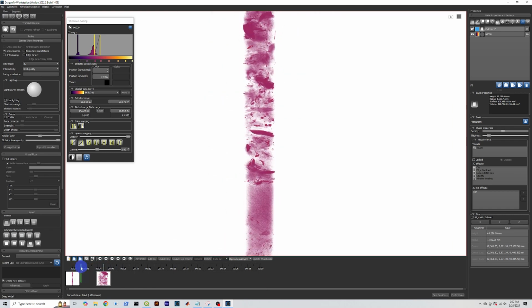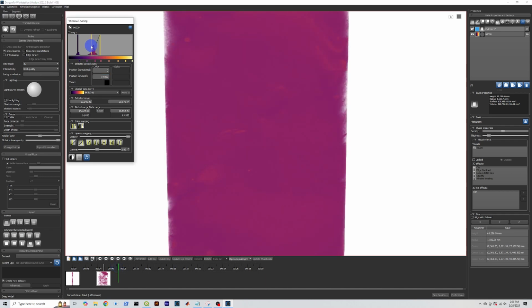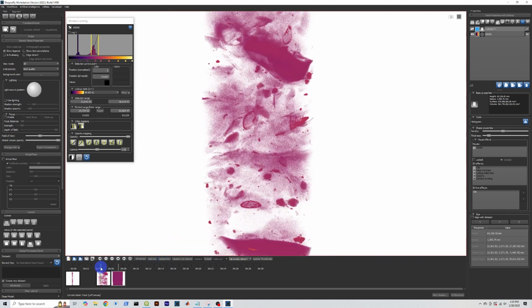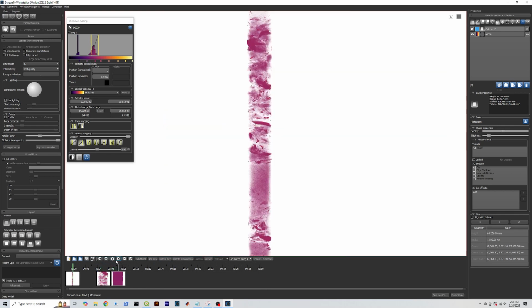Okay, cool. So we can do that, and for every keyframe, you can change whatever you want. Like you can also change the visualization, but not the position in this as well. So now you could do something like this. I don't know why you'd want to do this. It doesn't look very good. But you can change the color mapping, and then you can add a key. And you can see what that would look like here. We can just click play. So now it faded to that new color mapping.